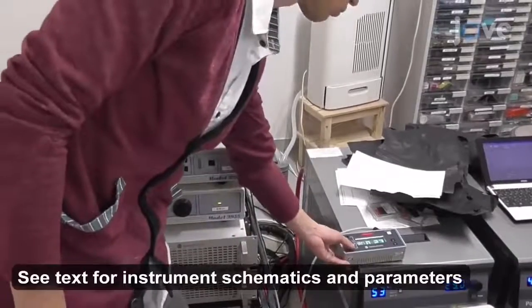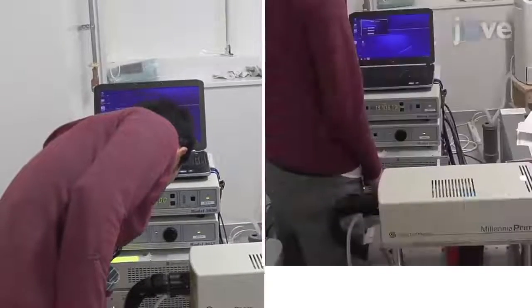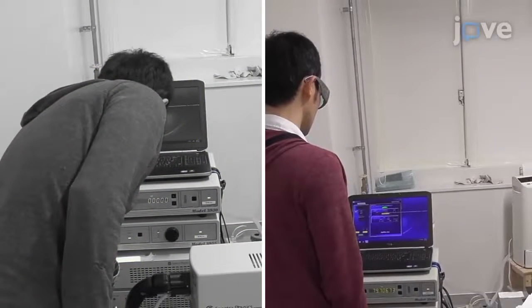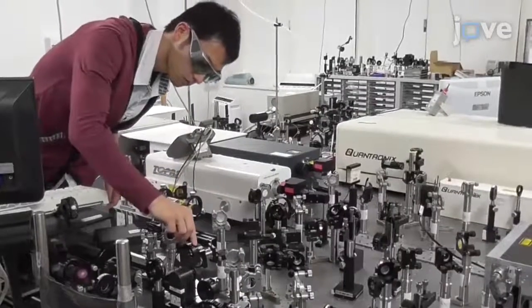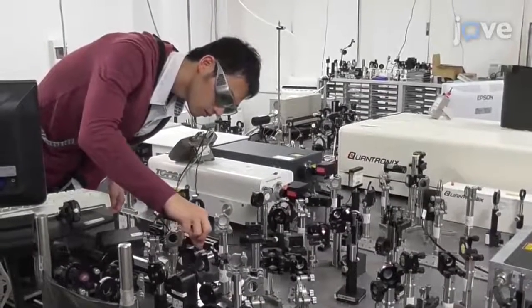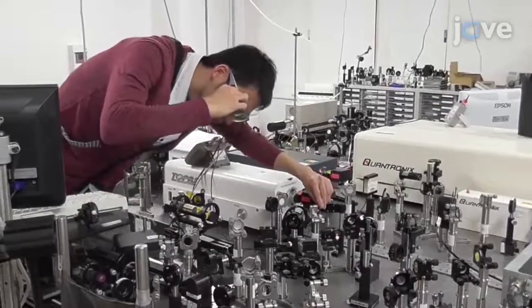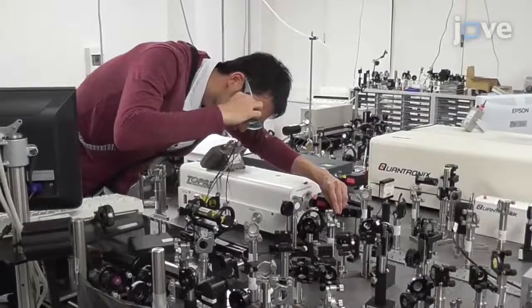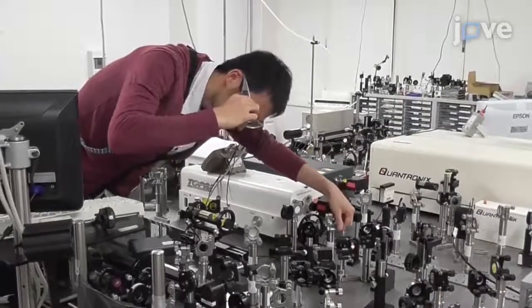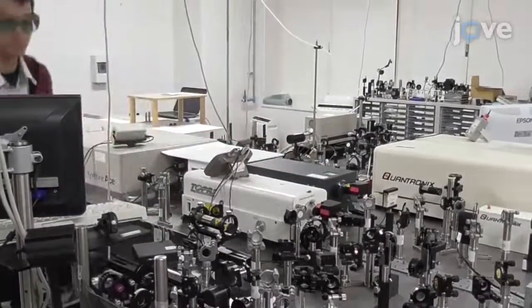After preparing the sample, turn on the titanium sapphire laser and the chirped pulse amplifier and allow them to thermally stabilize. Set the pulse duration to 120 femtoseconds, the repetition rate to 500 Hz, and the incident fluence to 1 millijoule per square centimeter. Check the power and stability of the UV pump and mid-IR probe pulses, and realign the optical paths as needed.